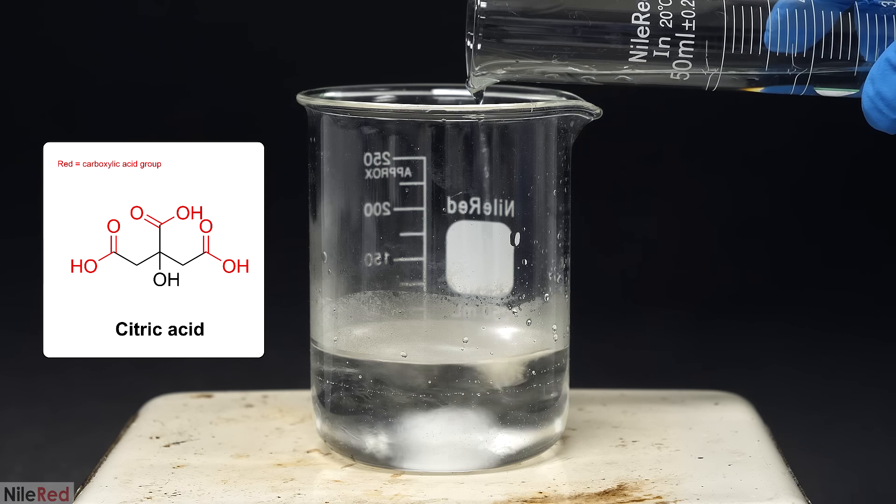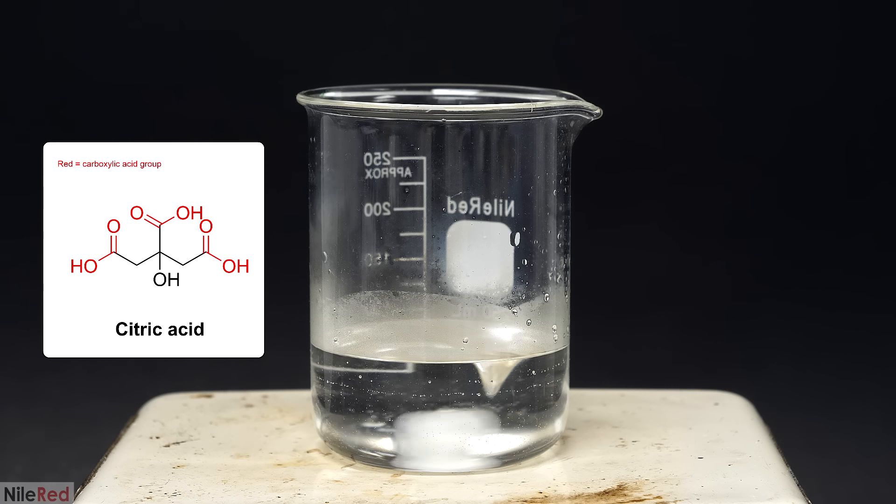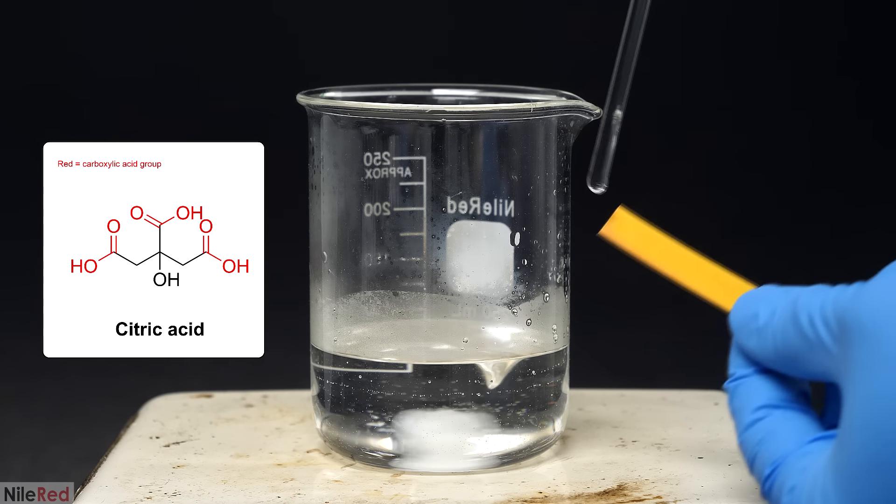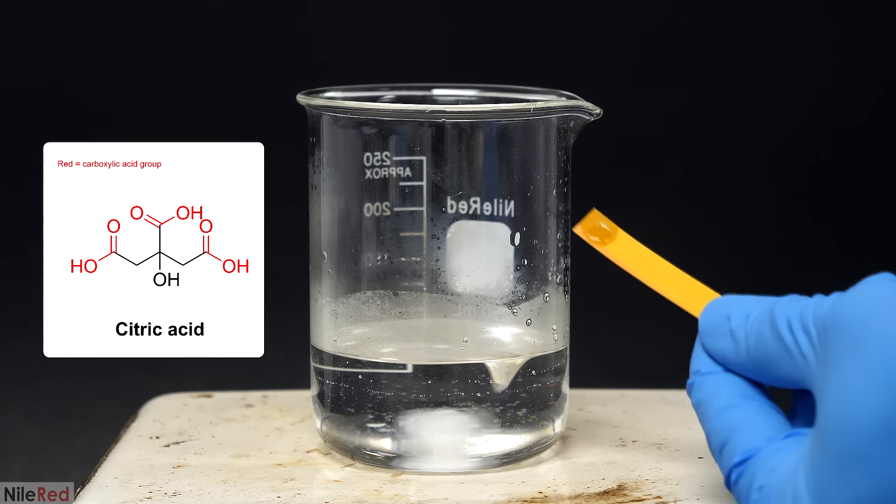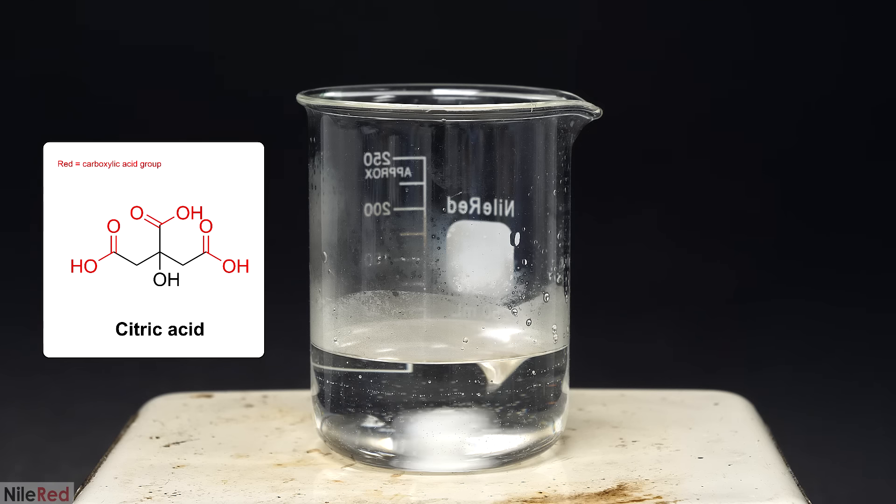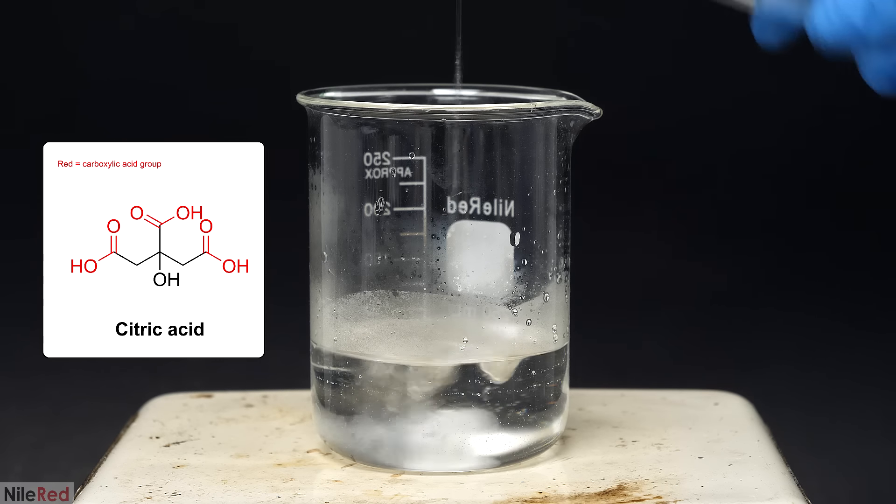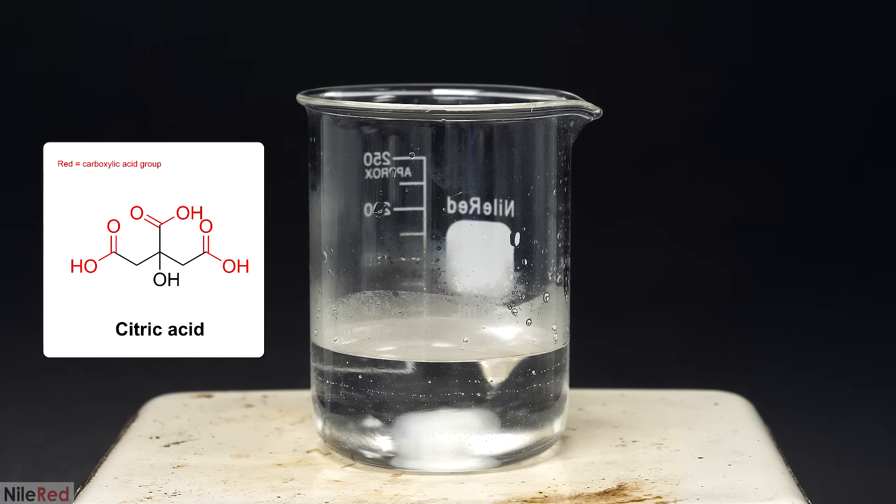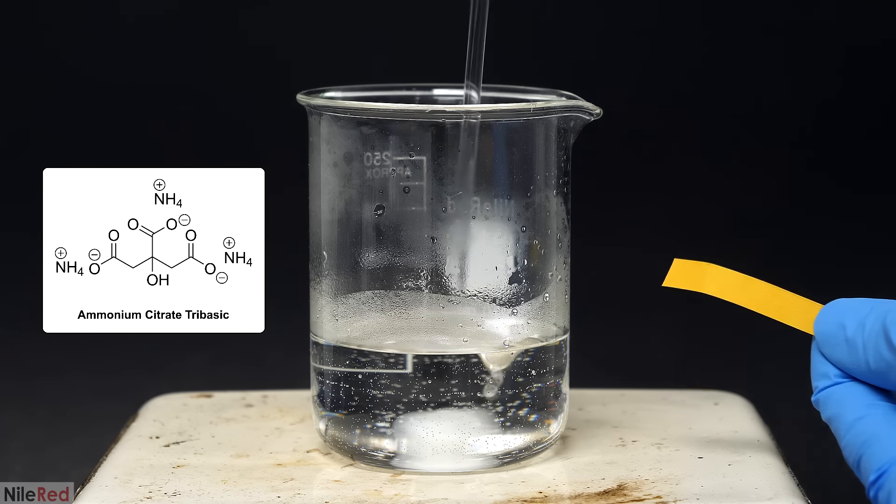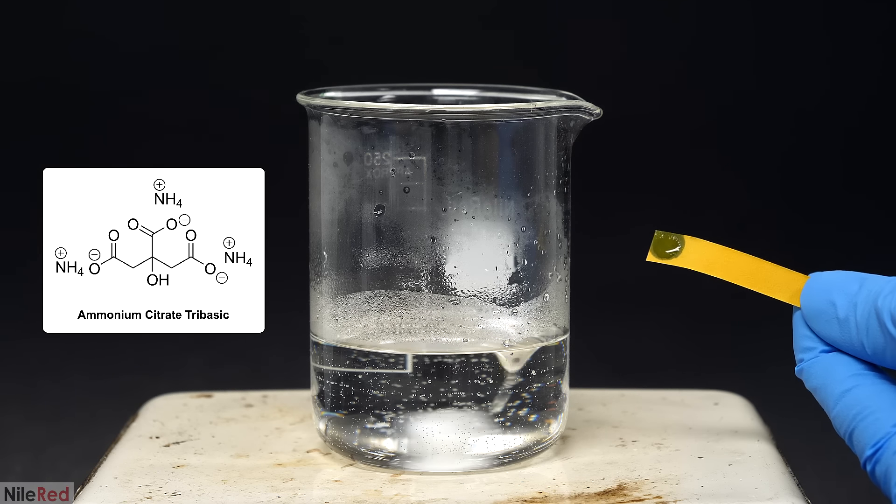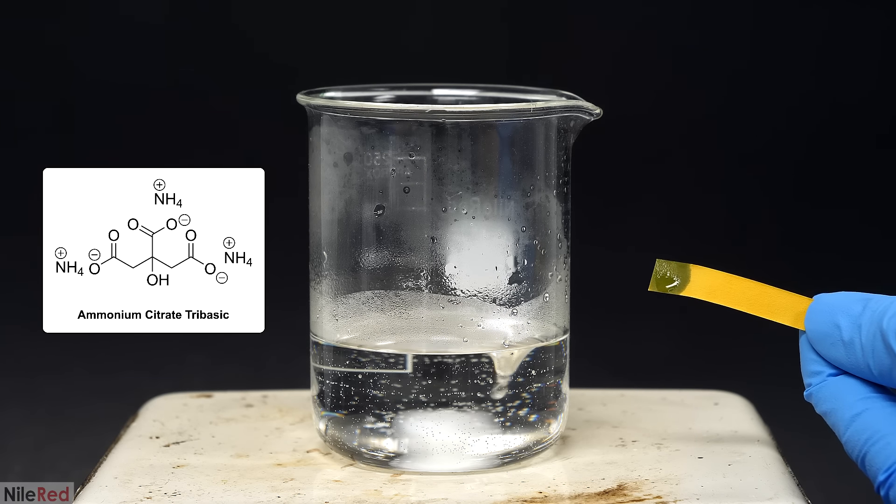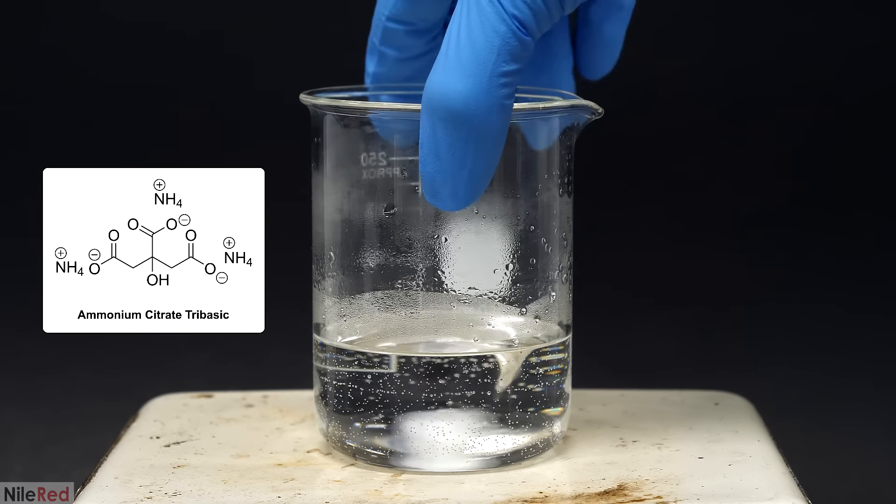Citric acid has three carboxylic acid groups and it can therefore react three times with ammonia. Each carboxylic acid group isn't equal though, and they all have different acid strengths. So as the ammonia was added it first reacted with the strongest group, then the second and finally the third. By the time the pH was neutral or just slightly basic there was no citric acid left and it was all in the form of ammonium citrate.